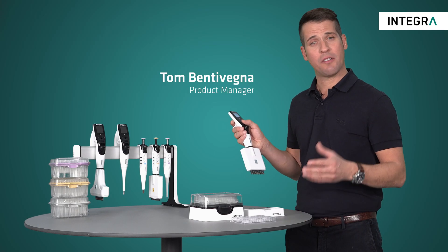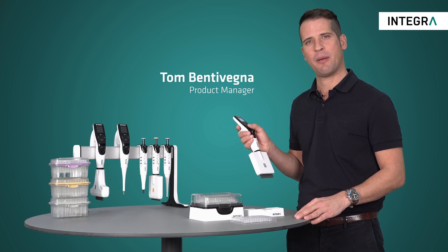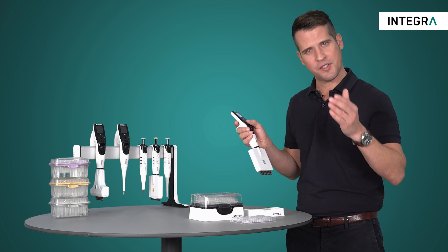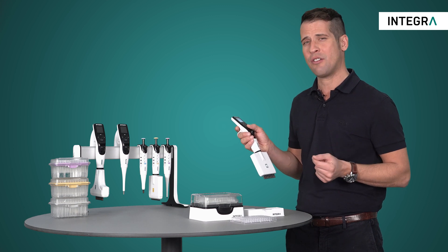If you're currently not pipetting using repeat dispense mode, you're missing out on one of the greatest benefits of electronic pipettes. Being able to aspirate liquid and dispense it into smaller aliquots is a real time saver and cuts down on user error.